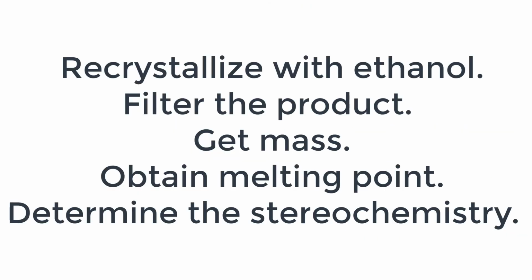Recrystallize with ethanol. Filter the product, measure the mass, and obtain a melting point. Determine if your product is EE or EZ.